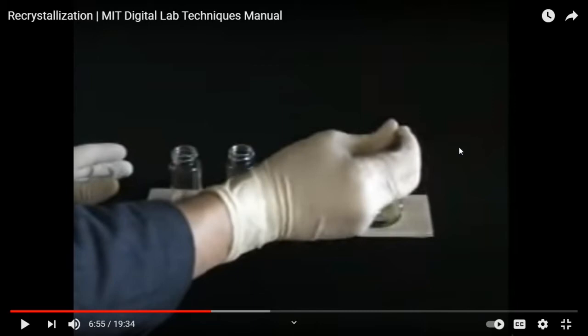Because the colored impurity is in a smaller amount than the major compound, we put in a little bit of charcoal powder, then the charcoal is going to randomly absorb colored impurity molecules, right? And the main compound as well. You lose some compound by doing this anyway, but you only need a little bit because your colored impurity is a little bit.